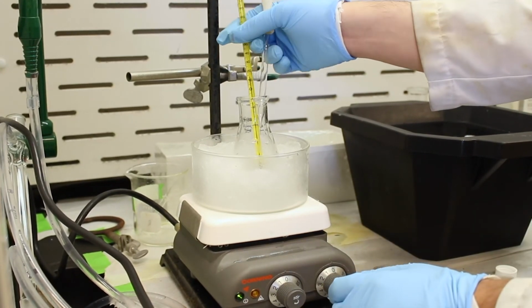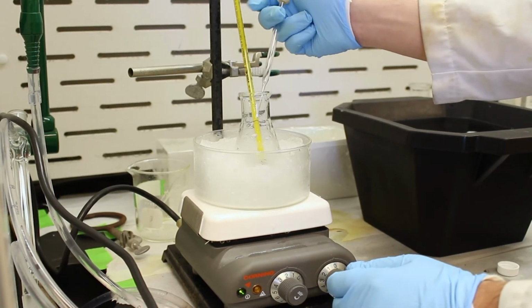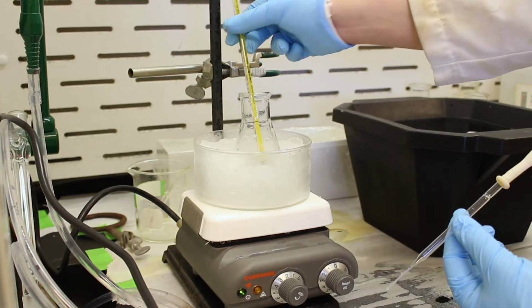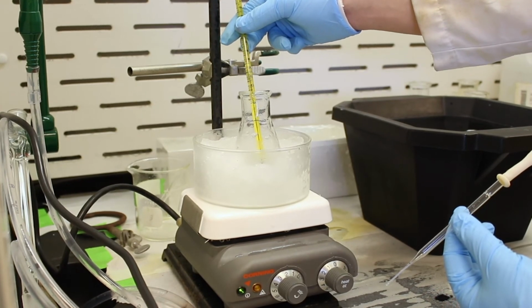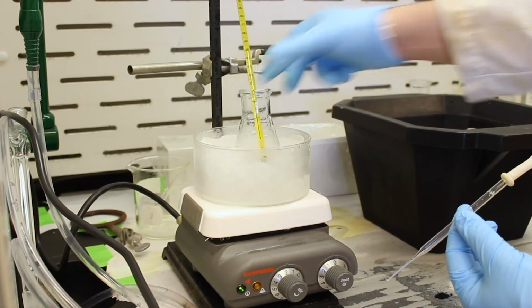So now what we're going to do is turn on the stirring, and we're going to check the temperature. So let's see. Right now we're at, oh, very good. We're right at 14 degrees Celsius, which is right where we want to be.